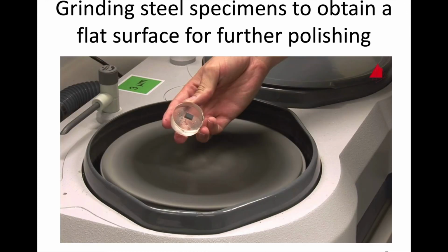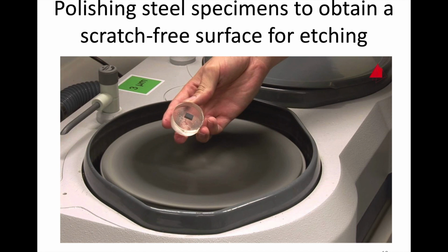And then everybody's favorite, metallography. So we'll be grinding our steel samples after they've been mounted, right? So they get cut with a cutoff saw, and then they get mounted in either epoxy or acrylic. And then we're ready for grinding, which you're familiar with, our operation here on the grinding wheels. And then we polish, which is more or less the same activity with just different materials.